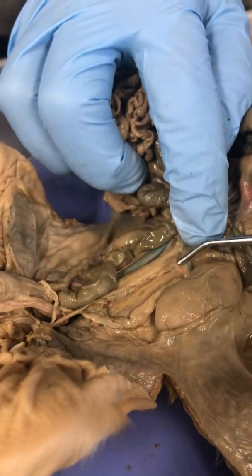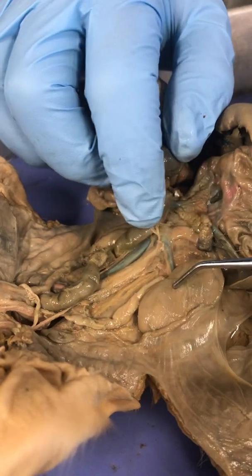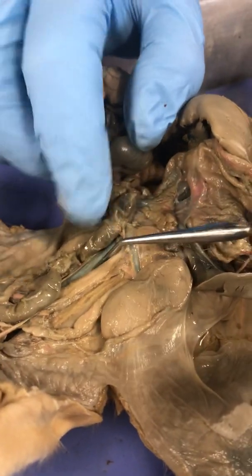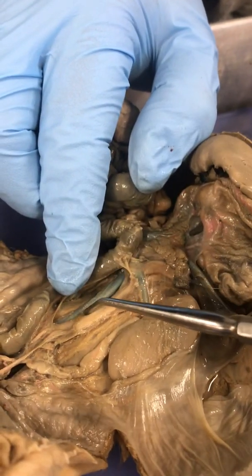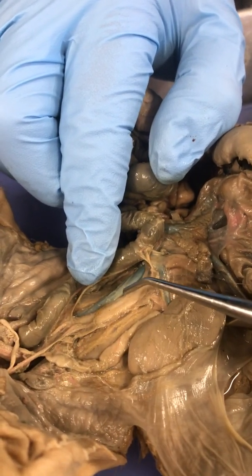On this one, you can see the renal artery coming off the abdominal aorta, feeding blood into the kidney, and you can also see the renal vein draining blood back into the vena cava, which lies generally to the right of the abdominal aorta. You always see it positioned right there in these pigs.